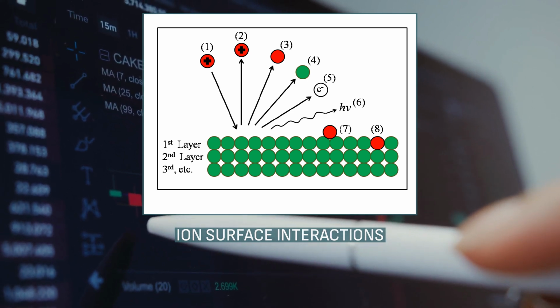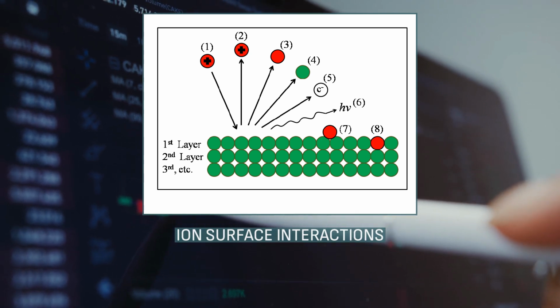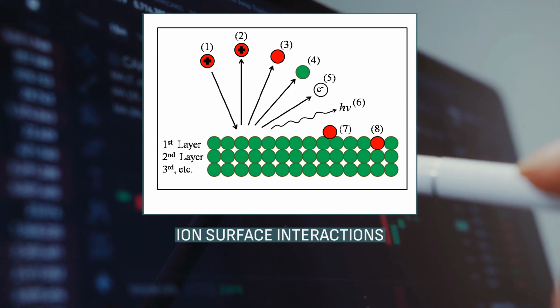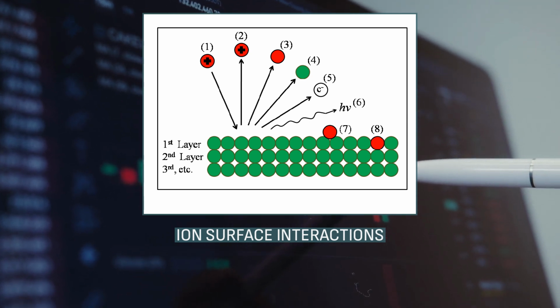However, analysis is often challenged either in terms of mass resolution when several comparably heavy elements are present in the sample or in terms of sensitivity when light species are present in heavy matrices.